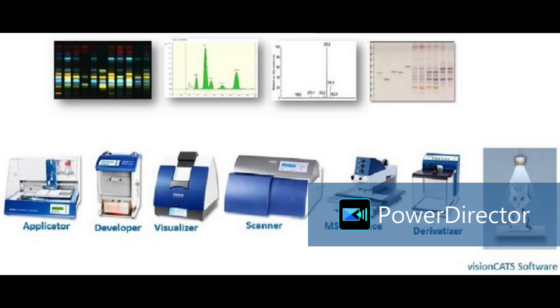Okay, so you understood the TLC and HPTLC difference. What exactly is HPTLC? It is a modular system. We look for separation of components, and after separation, detection with different techniques like hyphenation. This is the MS interface.